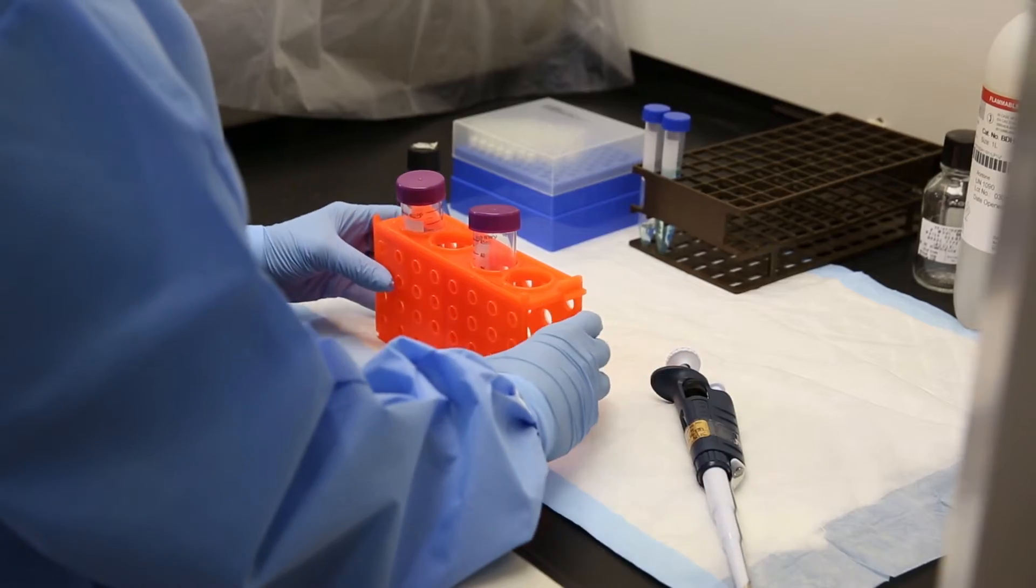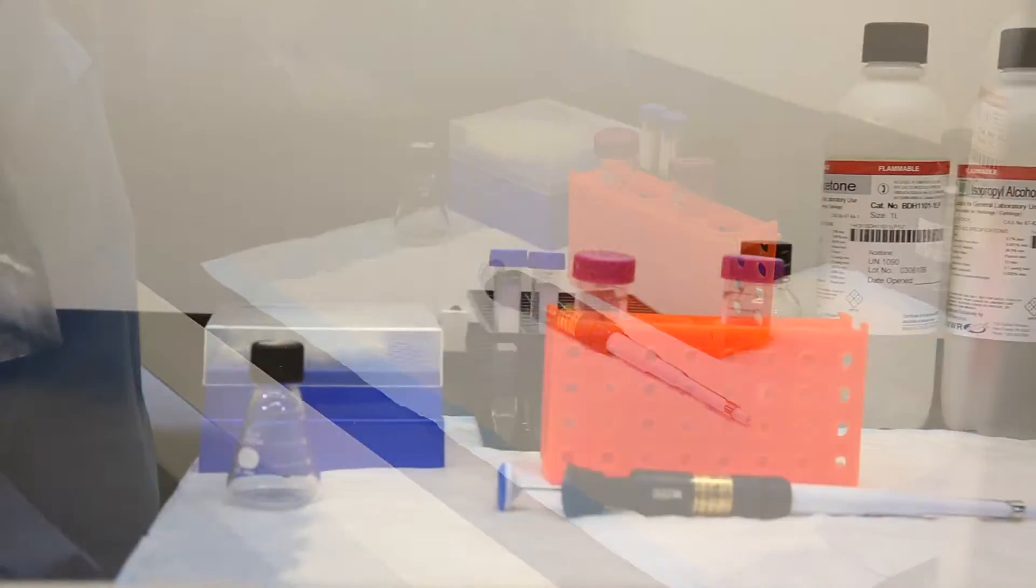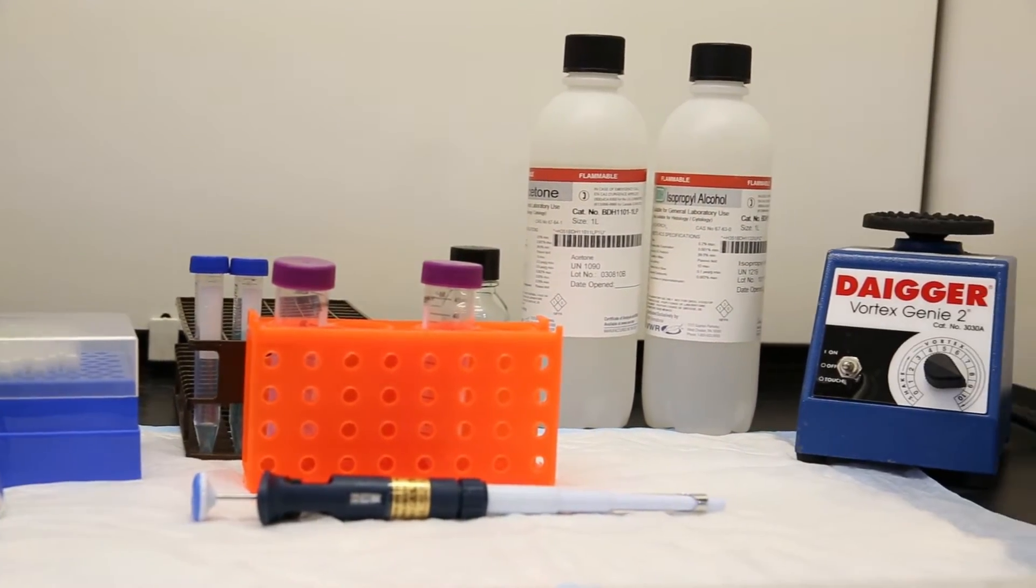Operate at least 6 inches from the front. The placement of objects close to the front opening may result in leakage and loss of containment.